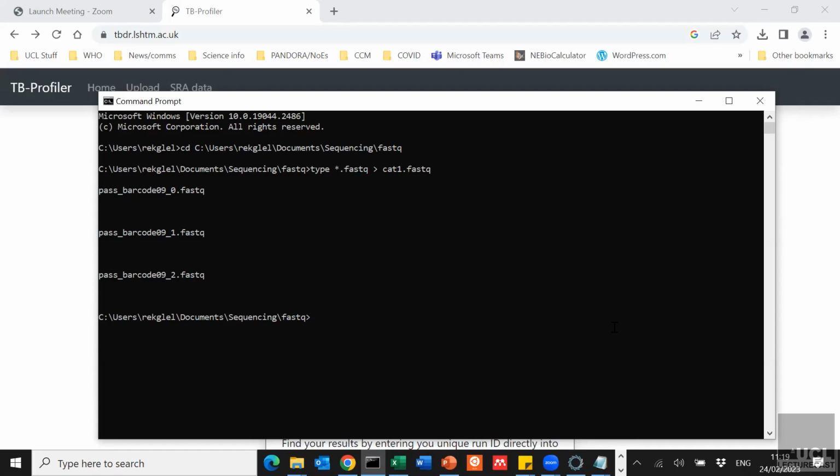I'm impressed with how quick a lot of these pieces have been. It's a lot of data that they're processing, and they're not designed for this. I was so impressed with how my little laptop managed, though it's really not coping with it.